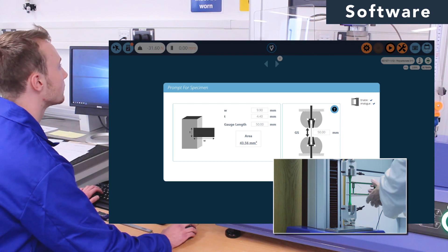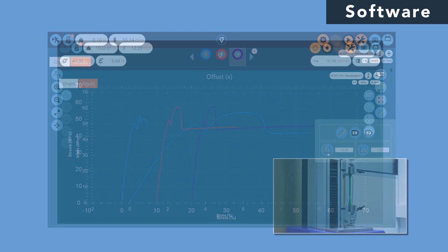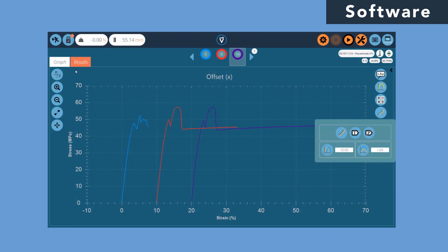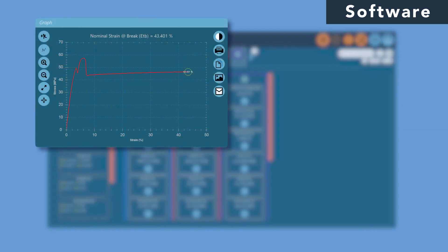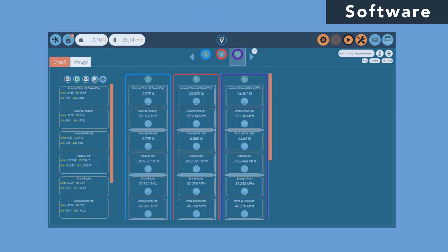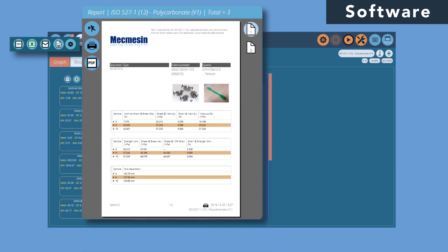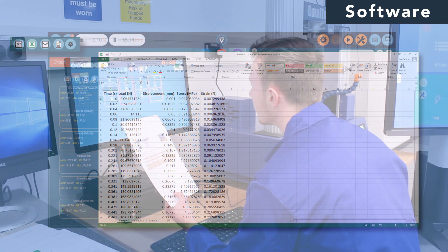As a consequence, optimal efficiency and faster testing are guaranteed. Once the test is underway, the most common stress-strain calculations can be applied automatically to the data. Results are available in real time and presented in fully configurable PDF reports or exported to external software like Excel for further analysis.